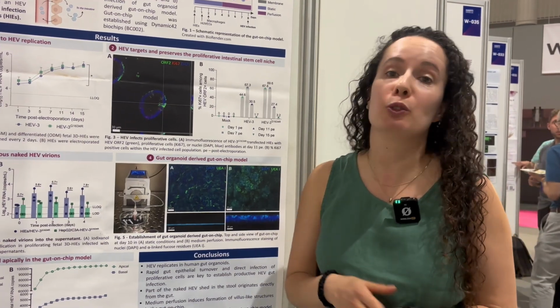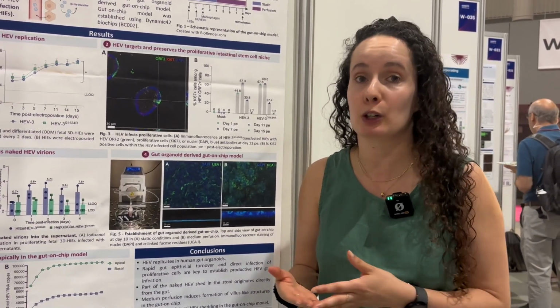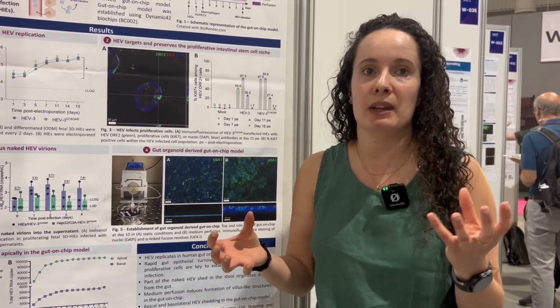I really advise the use of human-derived cells, like human organoids or human primary cultures, so that you can really take advantage of using the complexity of these cultures and the dynamic advantages of having this microfluidic system.